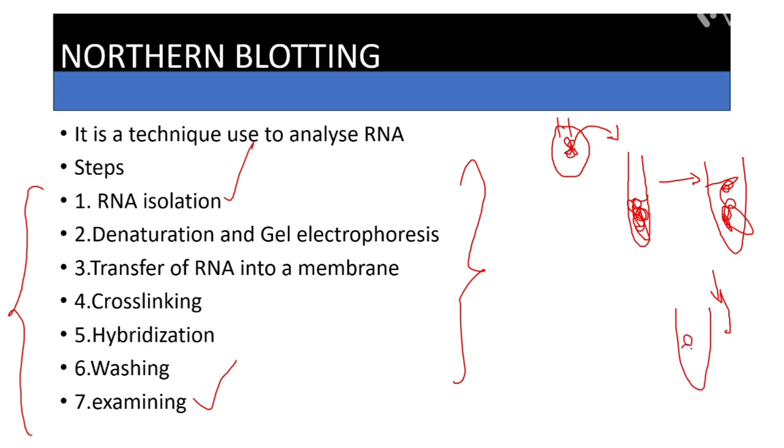In RNA isolation we use a mixture called trizol in order to separate our RNA from DNA and protein.